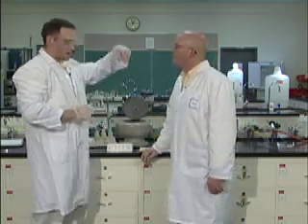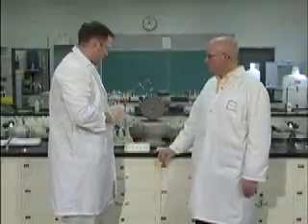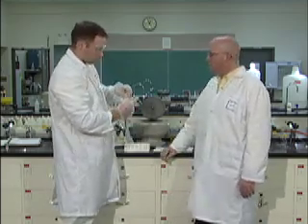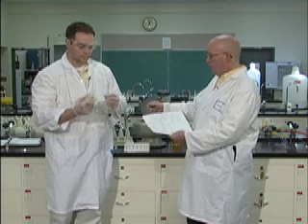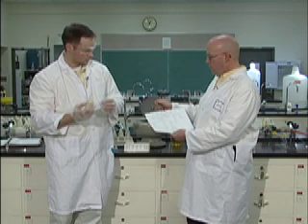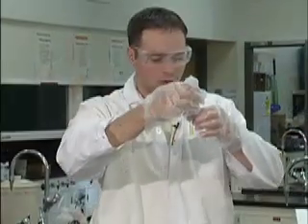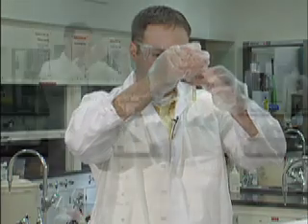Yeah. So now we take our decant from the first step. No precipitate in there, just a clear solution. We're going to add, again, NH4OH, which is ammonium hydroxide. To know which one you're doing, you just have to follow this chart. So right now we have the possibility of having calcium, copper 2, aluminum, or iron 3 in there. Correct? Exactly. And when I add the ammonium hydroxide, you'll notice something happens.